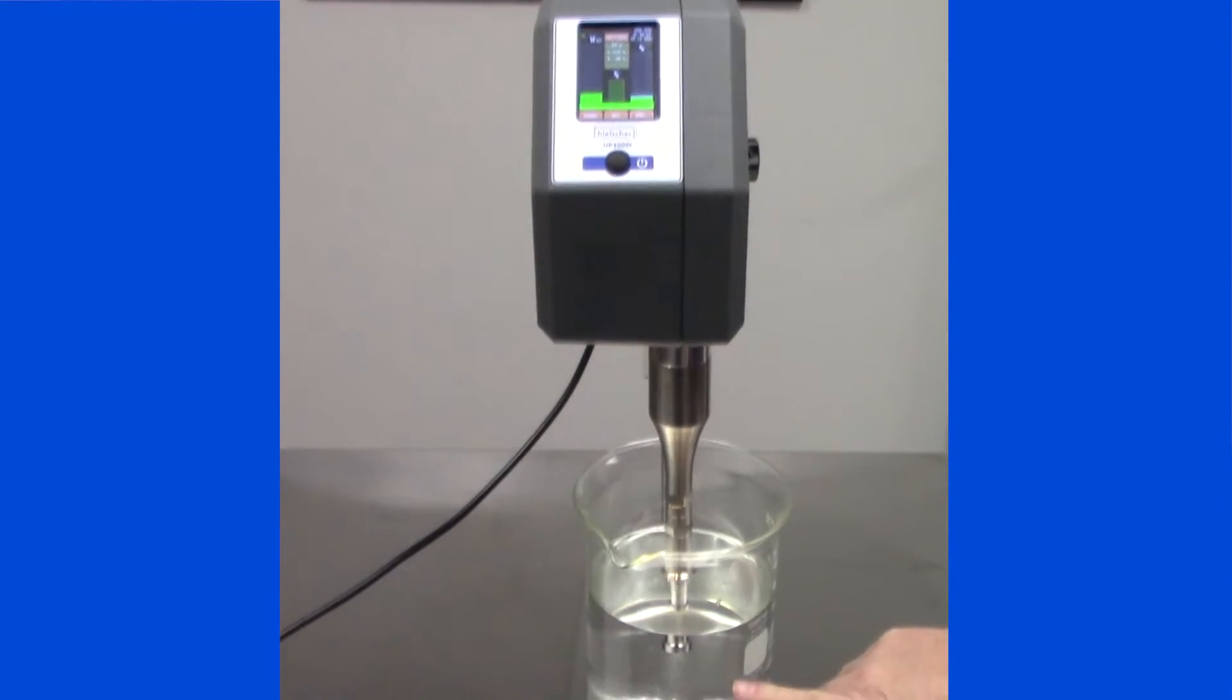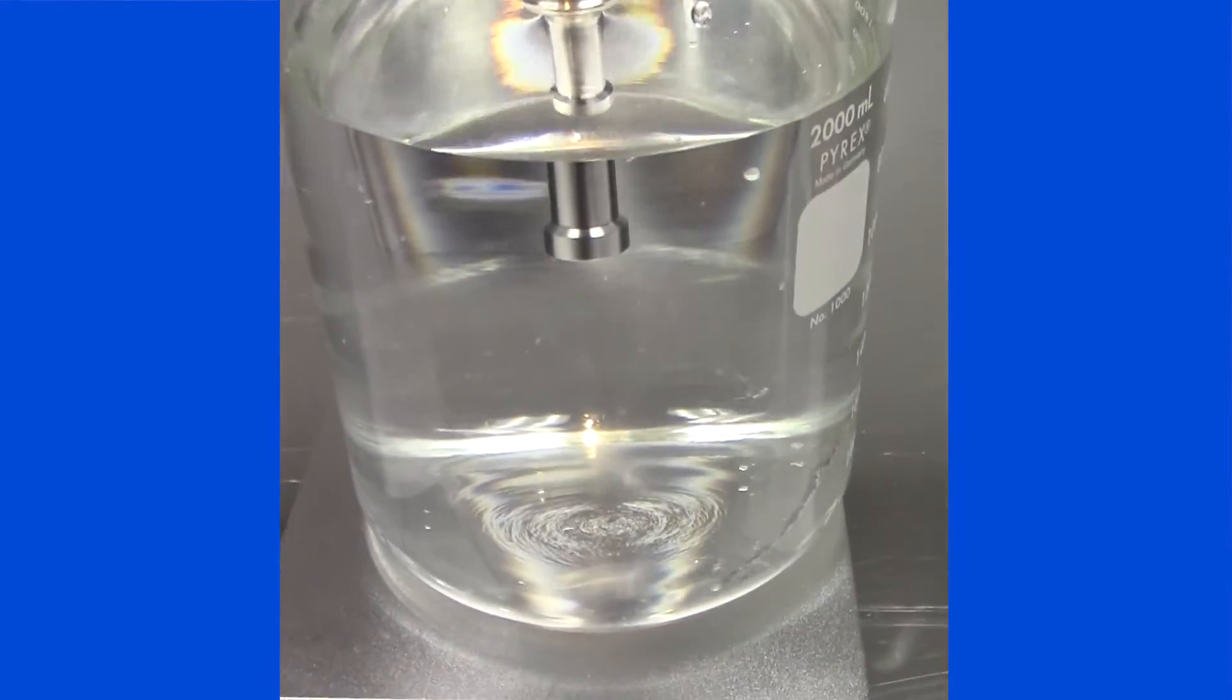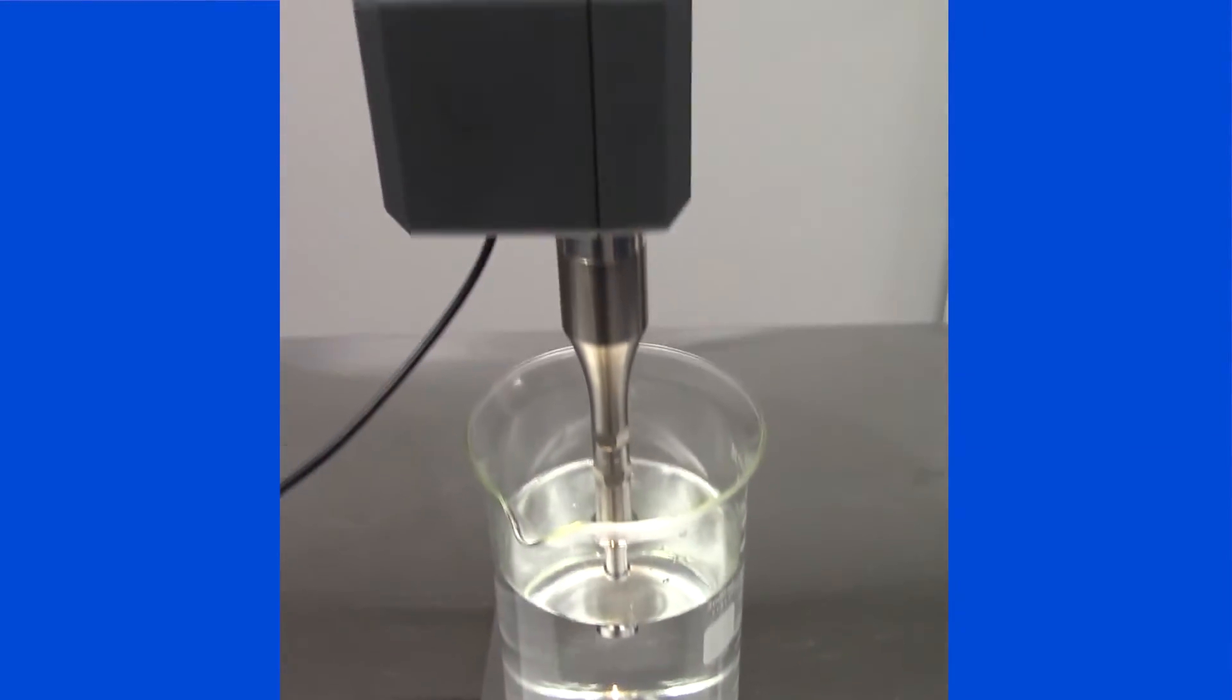You can see the cavitation field has formed mostly directly right under the sonotrode. I'm going to change the intensity by increasing the amplitude, thus making the cavitation field more intense.